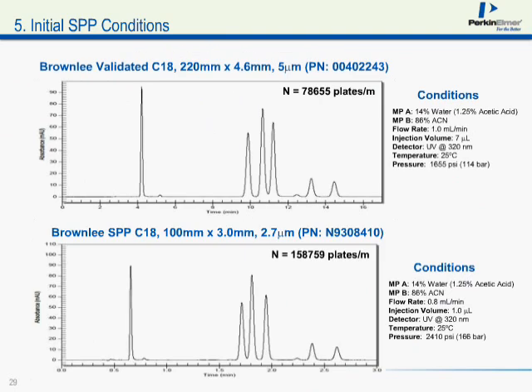If you look at the comparison, the two chromatograms are very similar. You'll notice the avobenzone position relative to the octocrylene and octinoxate is a little bit shifted to a shorter retention time, but the time savings is enormous. You're looking at a 16-minute run going down to under 3 minutes with the same resolution or better.